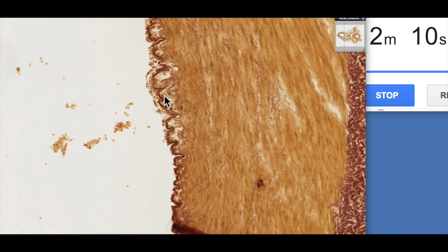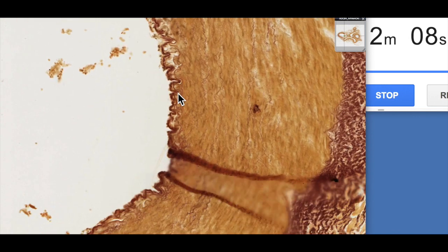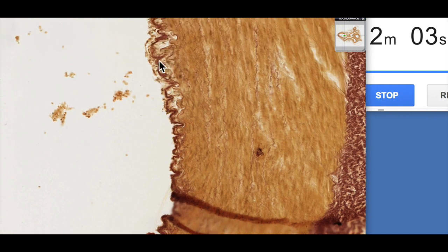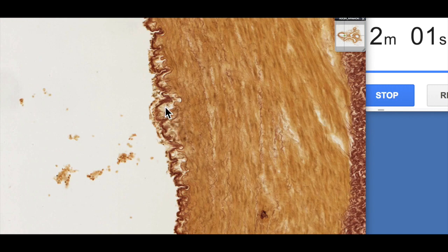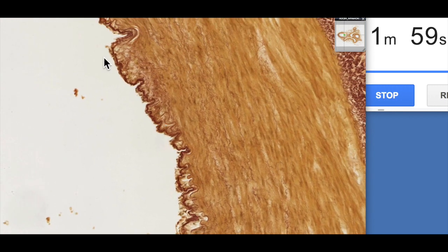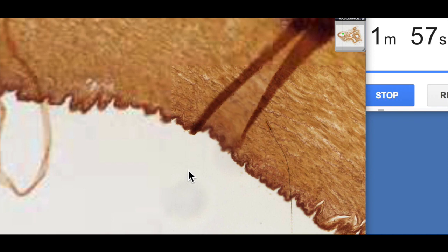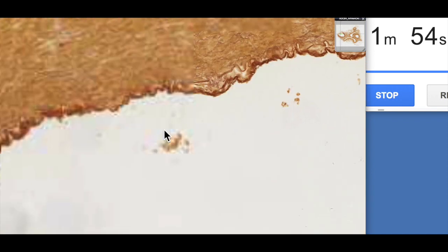It's actually really characteristic of muscular arteries, and it often produces this sort of waviness to the tunica intima, which is really characteristic of a muscular artery. So if you can see this waviness, you're pretty much assured that you're looking at a section of a muscular artery.